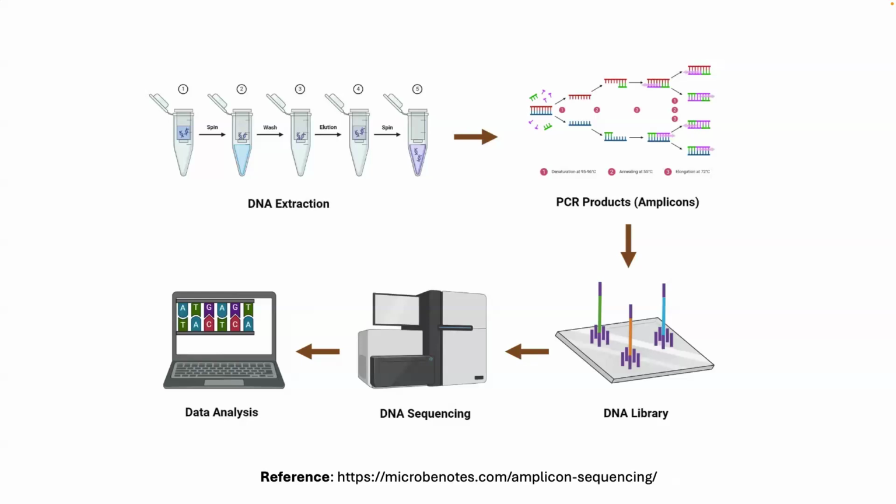With the samples prepped, we moved on to DNA sequencing using a platform like Illumina. This process generates FASTQ files which contain raw sequence reads along with quality scores. At this stage, the data is still messy. It includes sequencing errors, merged sequences, and other artifacts that need to be removed before we can make meaningful conclusions. This is where bioinformatics comes in, and where our module will start.